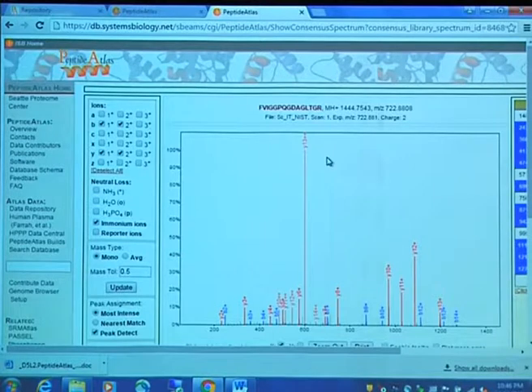So this is the NIST yeast ion trap library. Do you remember, actually, I was in the wrong build. I was not in the, which type of build? The yeast QQQ build. So the triple quad is a type of instrument, and so the spectra may look different. So if you're working across instruments, oftentimes the spectra will look different.